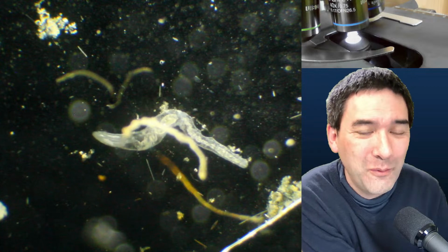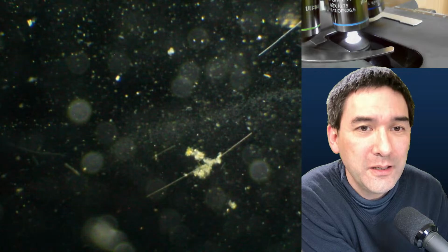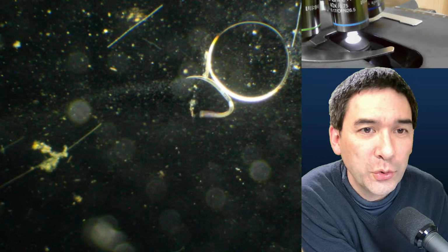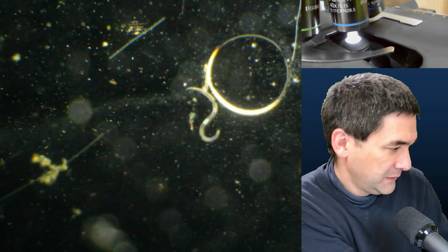Okay, a worm. Okay. And here they are. What's this over here? It's a nematode worm next to the bubble. But let me see. Let's go a little bit higher with the magnification.